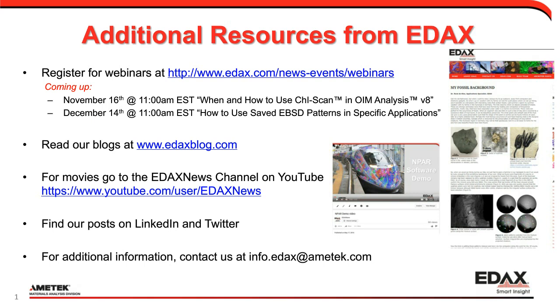Somebody mentions doing an analysis using an environmental SEM. Definitely the environmental SEM is going to give you some really nice advantages there, as well as just the traditional variable pressure or low vac SEM.